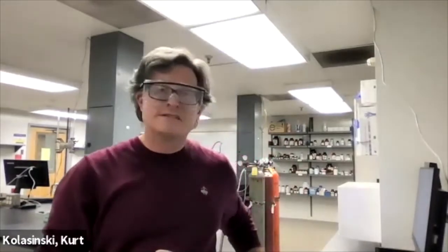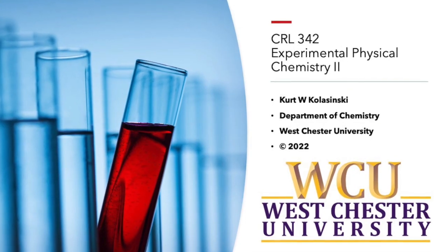And then, simple read. All you need is the fluorescence intensity for each one of those temperatures. Then I'll send you that data, and you can see what it looks like. Let me tell you, it's gorgeous. All right. That's fluorescence quenching. Thank you.